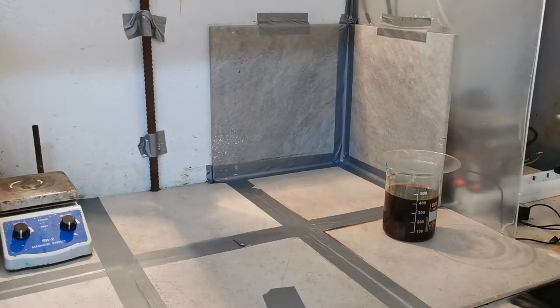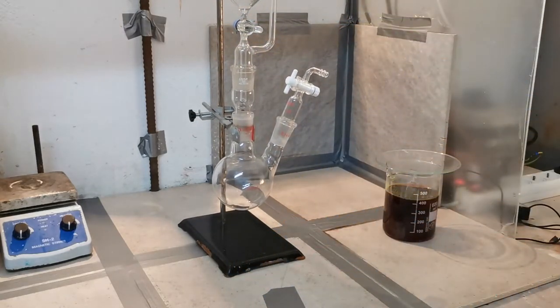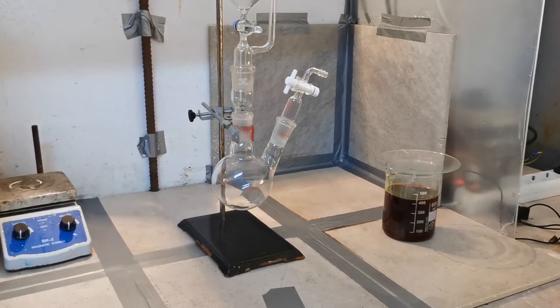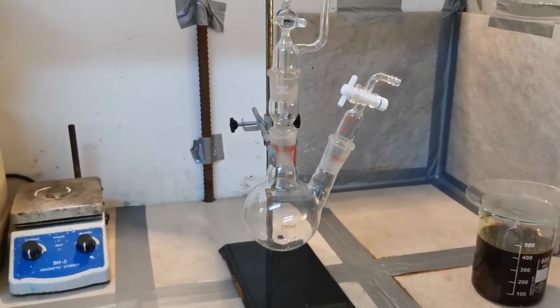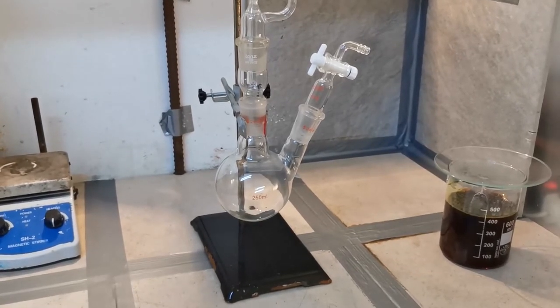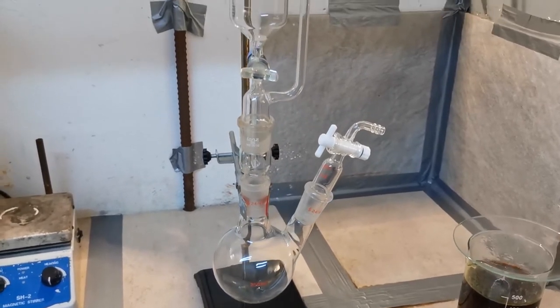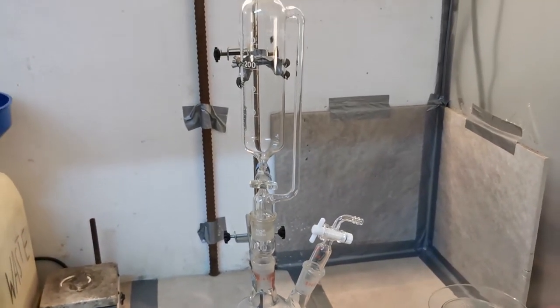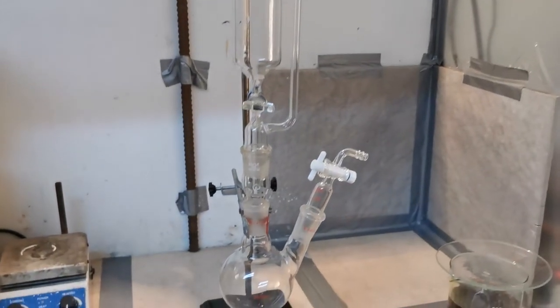Now for the actual production of hydrogen sulfide, I assembled this apparatus using a two-necked round-bottom flask, but a Claisen adapter is also a good option. Apart from that, it consists of a pressure-equalized addition funnel, which in my case needed an expander piece to fit the joints together. And of course, a gas outlet adapter. In theory, this can also be mounted on top of the addition funnel and used with a single-neck flask.